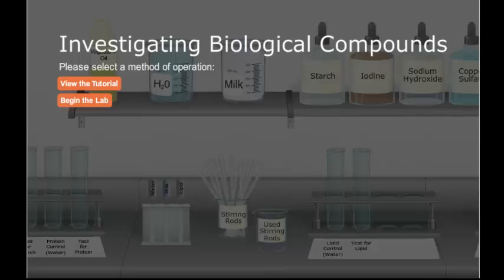All right, I know we were all looking forward to doing a bit of chemistry in lab this week, but since I cannot be here, we will have a virtual lab. Now, this virtual lab is going to be very similar to what we've done in class, just a little less fun because you don't get to play with the chemicals yourself, and I apologize for that. However, what we will be doing in lab this week is testing for biological compounds. These are compounds we will discuss more on Wednesday, but I'm going to go over them very, very briefly with you before you start this lab.